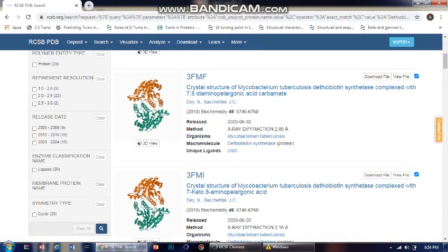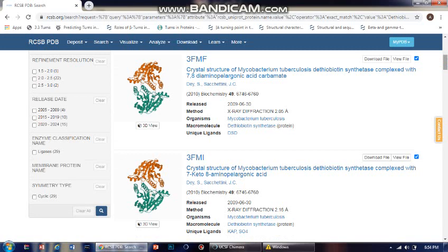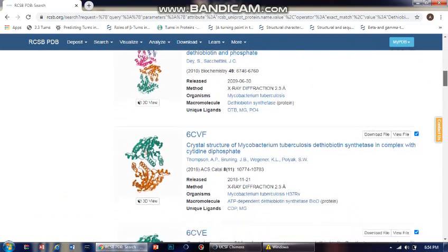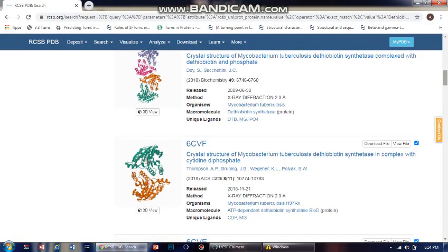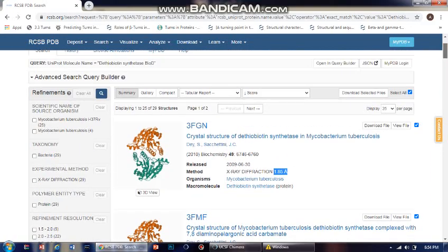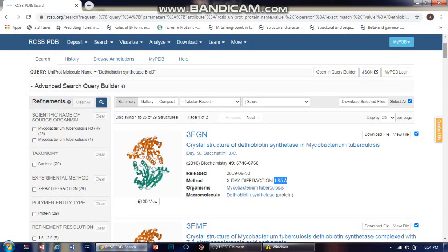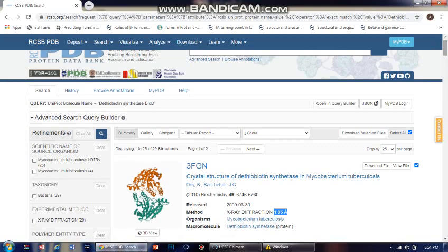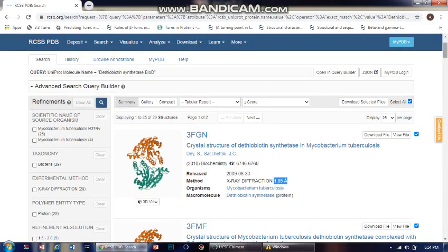However, if you want to visualize or study the protein with respect to bound ligands — for example, to learn the activity of the protein in the presence of a ligand, or to analyze the active site pocket — you have to consider entries with associated ligands and compounds. It totally depends on the criteria and specifications of your study.